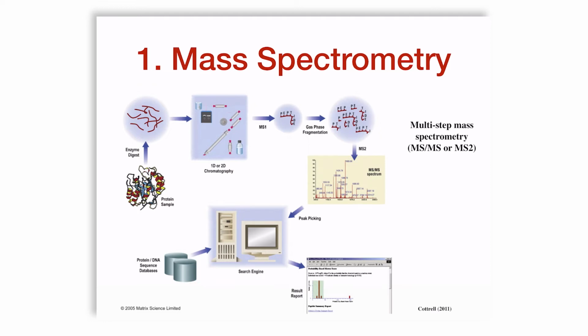This is essentially nothing but identifying the proteins. You can reverse this method and use this for a protein of a fixed band to also do protein sequencing, different from Edman degradation, for example. So this is how we get proteins and their identity.